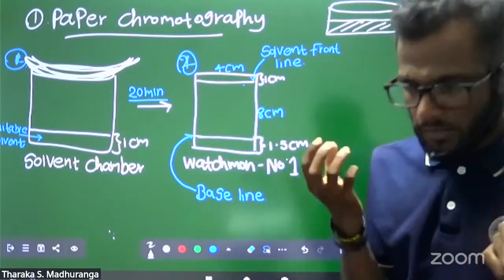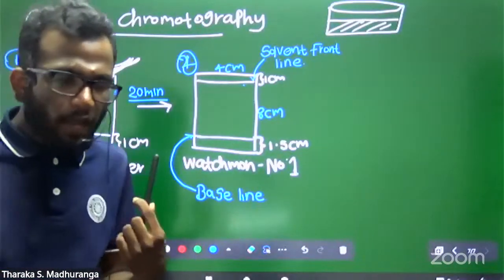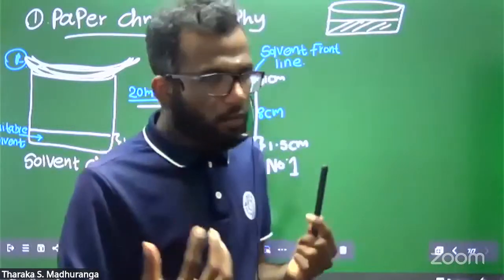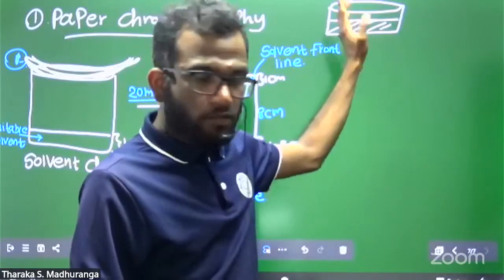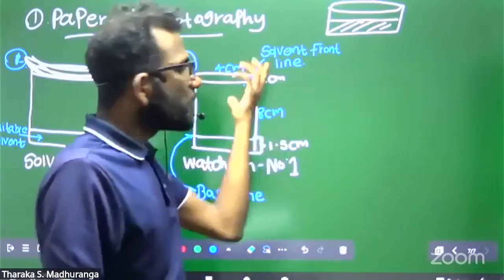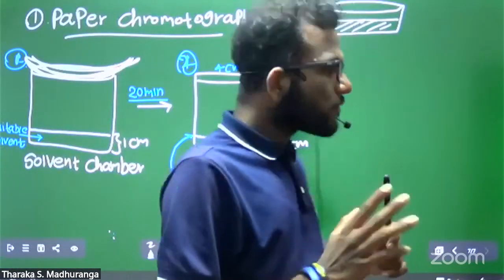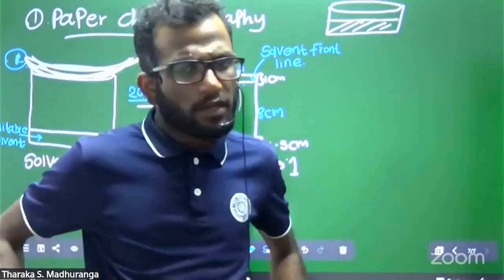This crude product is an extracted product from a cinnamon bark. Now I need to confirm whether this crude product has cinnamaldehyde or not. For that, we need to get the glass rod.